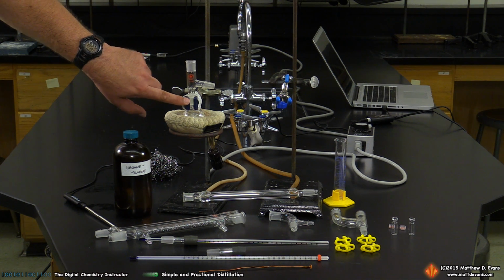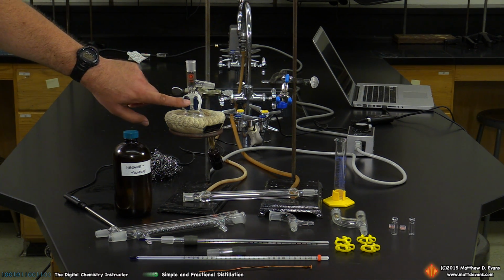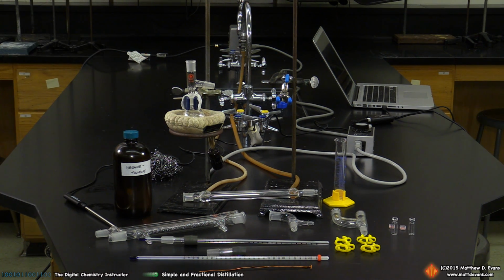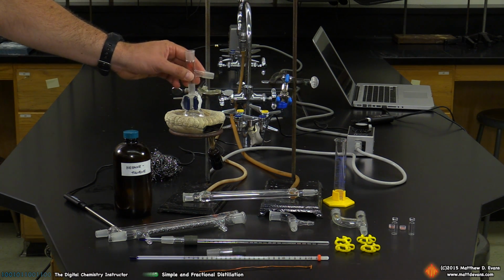And the most important clamp in the entire distillation setup is this one. This is a two-finger clamp. Don't use the three-finger clamps. This two-finger clamp is going to wrap around this round bottom flask. And in the simple distillation setup, this three-way adapter goes on top of this.